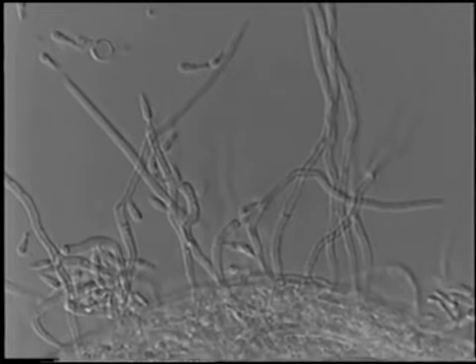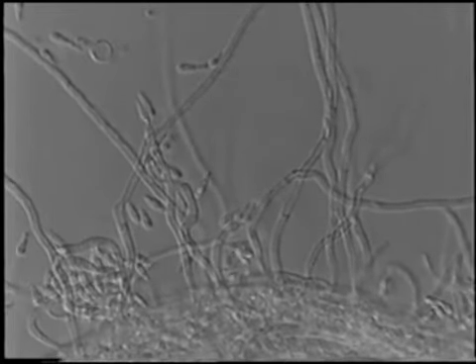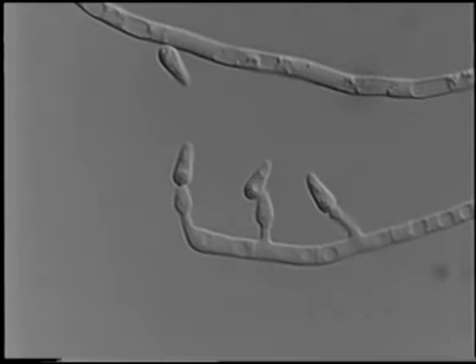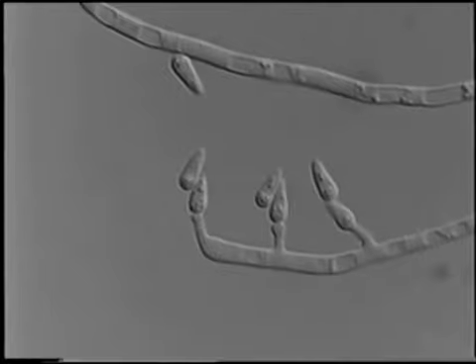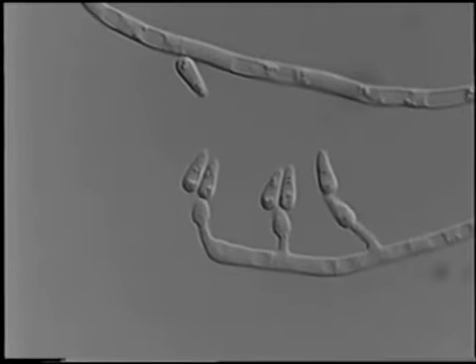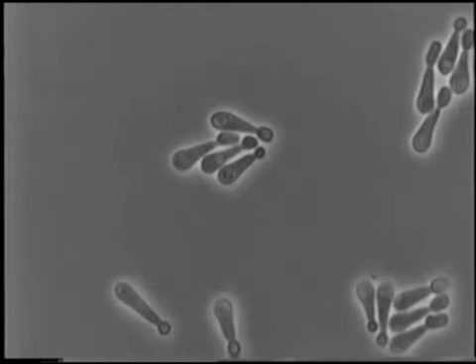The conidia are often produced in clusters. These contain 30 to 40 conidia. The conidia are produced in succession. After a short while, adhesive buds are formed on the conidia by which they may stick to new nematodes and infect them.